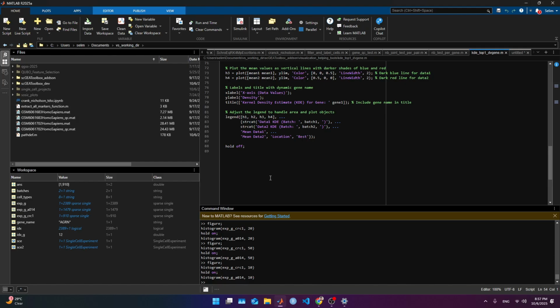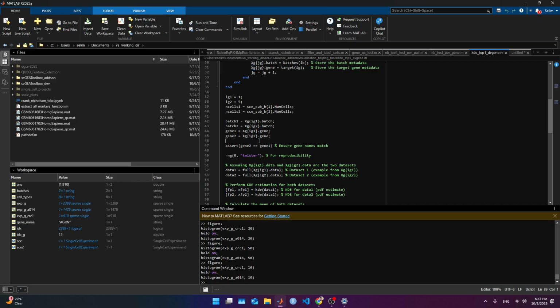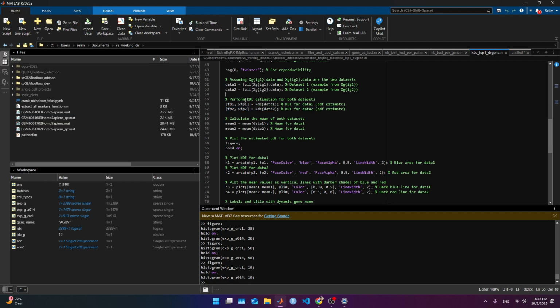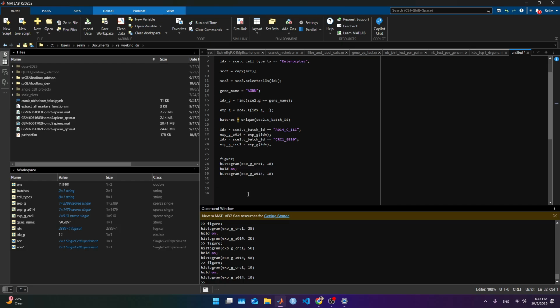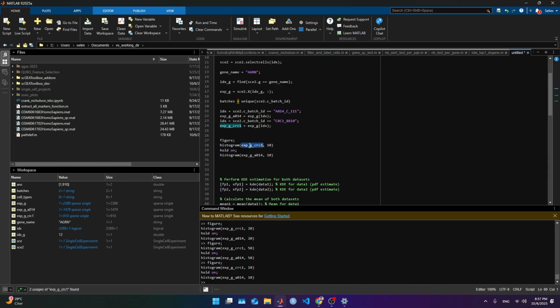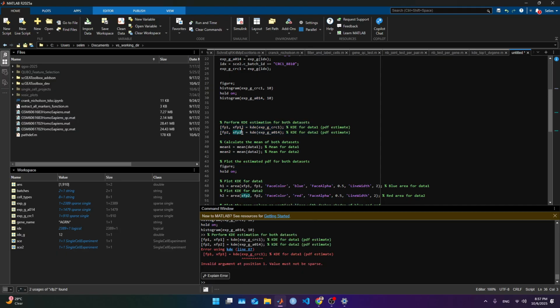So what I'm gonna do here is reuse my function, which is KDE. It's just as easy as this. But I'm gonna recycle this because it's gonna help us to have a nice plot. So we're coming back here, and I'm gonna walk through that piece of code. So this is one expression, and I'm gonna do that, and then the other. It's gonna do the kernel density estimation, and it's gonna get these two arrays.